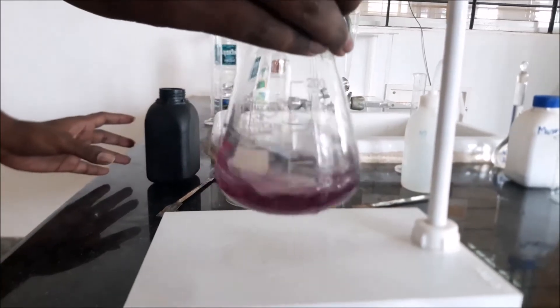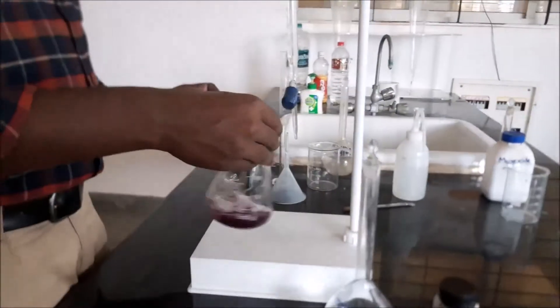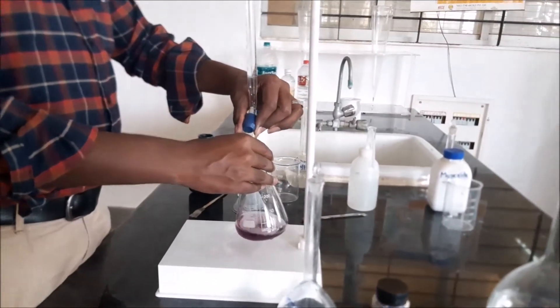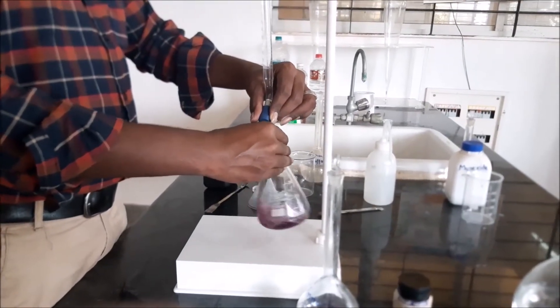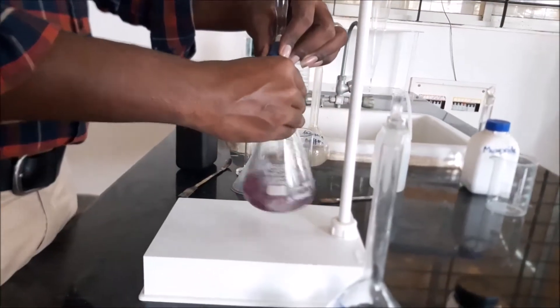After adding the ammonia buffer solution of 2 ml and Eriochrome Black T indicator, the sample has changed to wine red colour. Now titrate it against EDTA solution until the wine red colour changes to blue colour. Let's see.